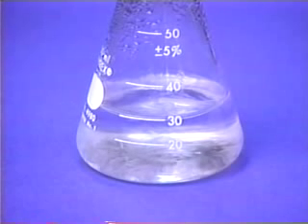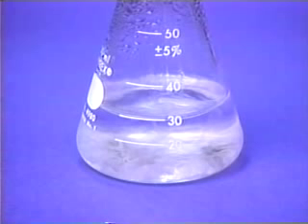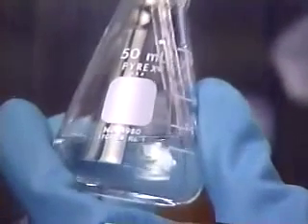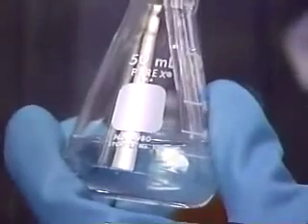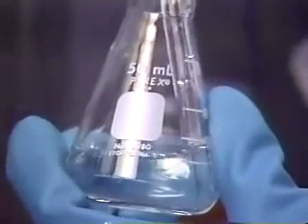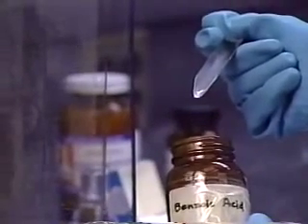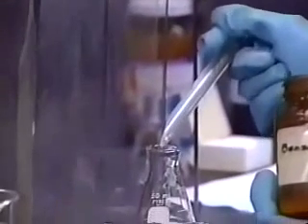In practice, occasionally crystals of a compound do not form readily as the solution cools. In these cases, the solution has become supersaturated and crystallization must be induced. One method for inducing crystals is to scratch the inside of the flask at the surface of the solution. Another method is to add a seed crystal, which is a small crystal of the original material.